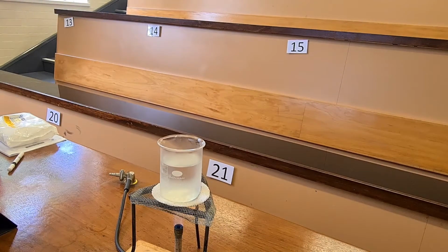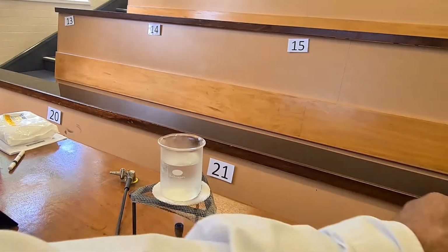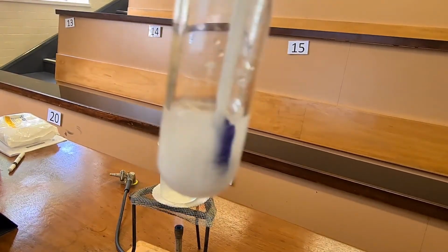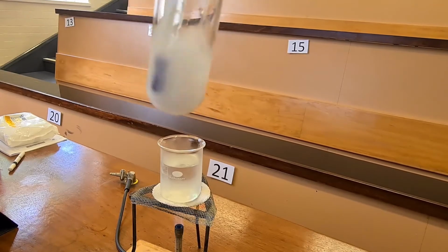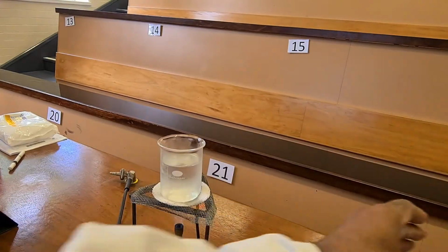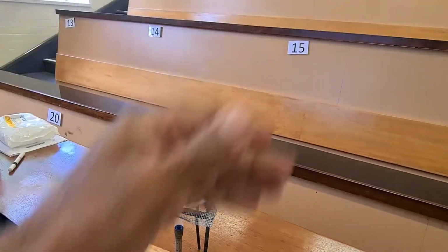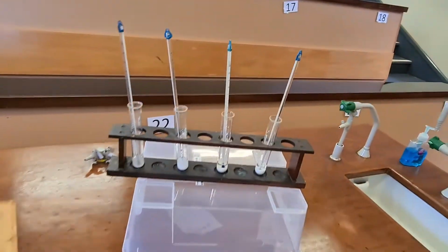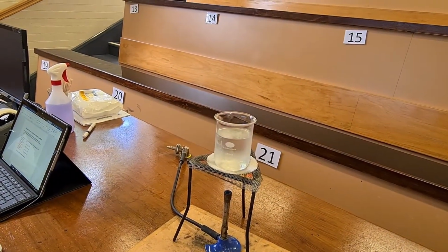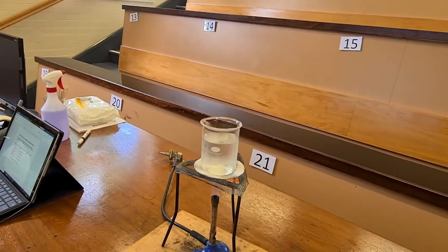Now I need to get the water hot and then stand these test tubes inside the water. These test tubes have got ammonium chloride, and at room temperature that amount of ammonium chloride in each of the 4 test tubes does not dissolve. None of them will dissolve at room temperature. But if I get the water inside the test tubes warm enough, then it will dissolve.